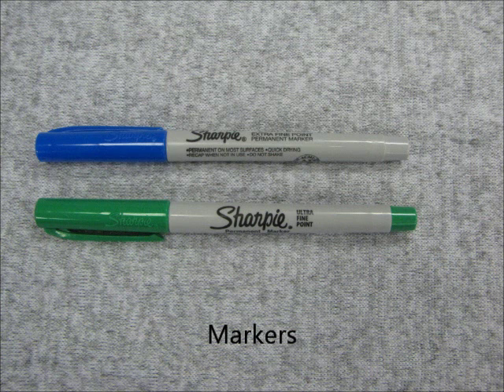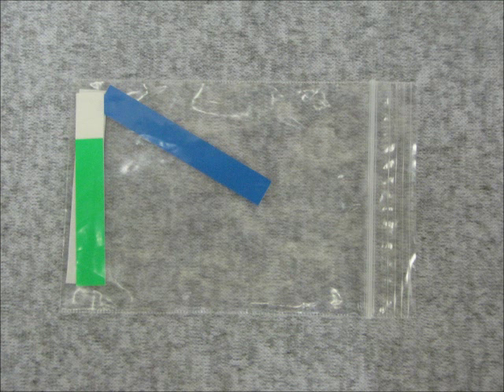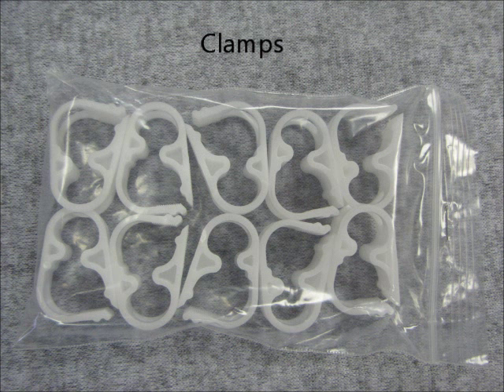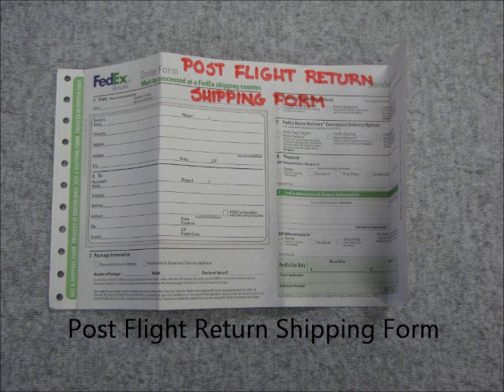The kit also includes blue and green Sharpie markers, blue and green colored tape, plastic zip ties, plastic clamps, and your post-flight return shipping form.